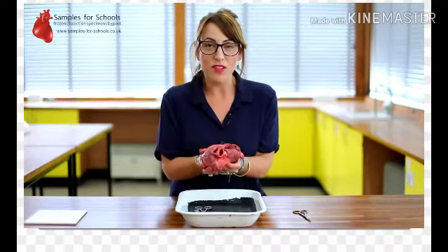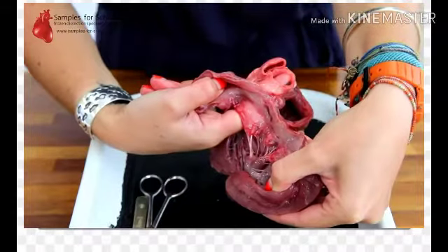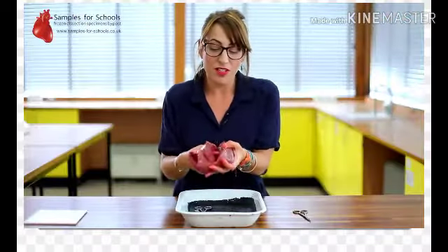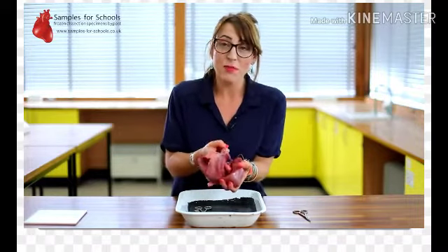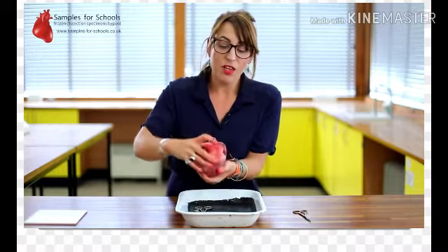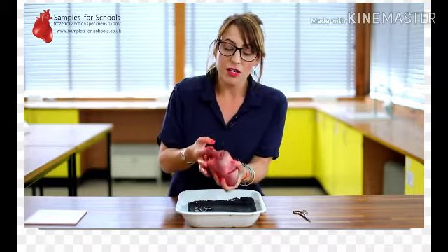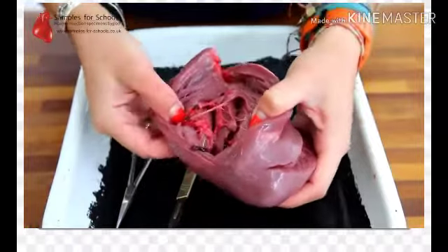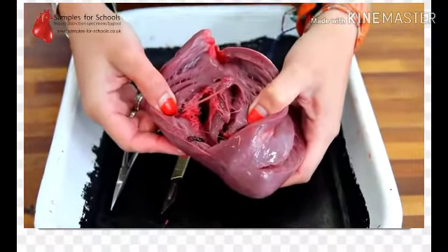So if we go back to the blood vessels that we can see at the top of the heart, we can use a seeker or a finger to put a finger down the vessel to see where the chamber ends. So if we go down this blood vessel, it comes out into the left ventricle, the thick, chunky ventricle. So that must be our aorta that's going to pump blood around the entire body. If we were to explore the other blood vessel, which is much thinner, it goes straight into the right ventricle, the thinner, less muscular ventricle. So that must be the pulmonary artery that's going to transport blood from the heart to the lungs.